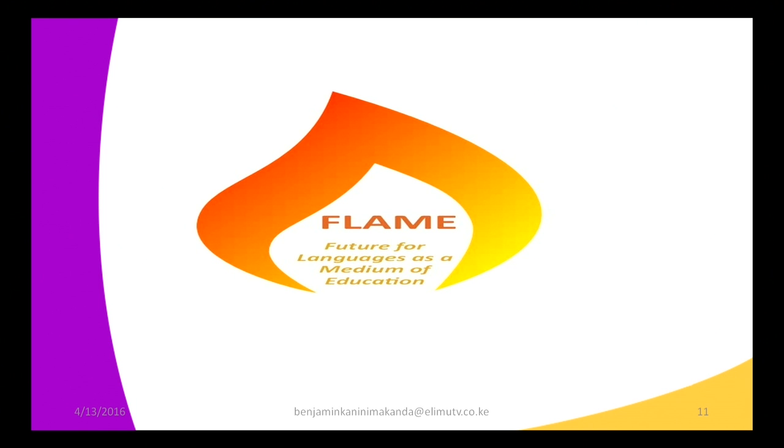So we now want to look at what is produced when the lab gas is mixed with air. What is formed? Look at my photo here. Are you able to read? Inside you will get the word flame. Now, what symbol does this one represent? What is the color of the flame produced by a candle, a kerosene lamp, or any other source of heat? Does it resemble this one that you are seeing here? Maybe to some extent they resemble.